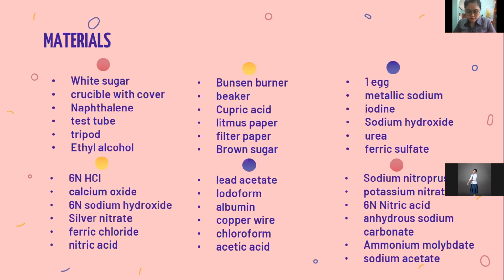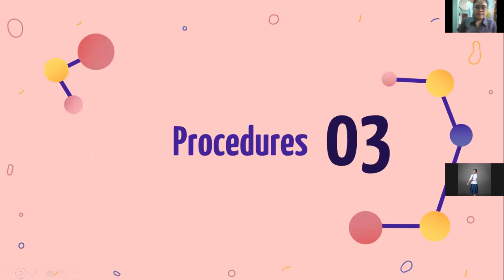acetic acid, sodium nitroprusside, potassium nitrate, 6N nitric acid, anhydrous sodium carbonate, ammonium molybdate, and sodium acetate. So next, for the procedure, Miss Musa will take over. Thank you.